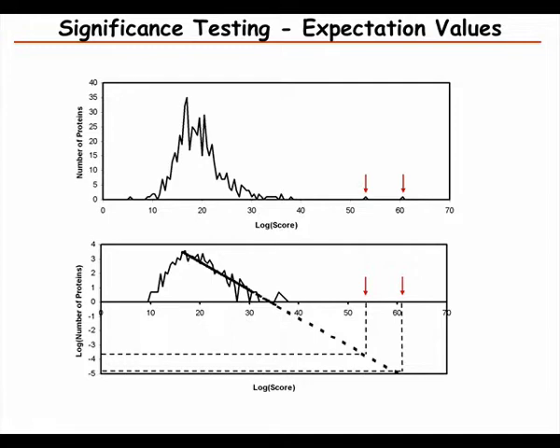So that way, if we search that in addition to searching the regular sequences in the database, we can get an estimation of what the random matching contribution is. And then we can estimate the false discovery rate. So if we set a certain score cutoff, we can estimate how many incorrect identifications we have. And this is probably the most widely used way to do it, because it's very simple to implement.